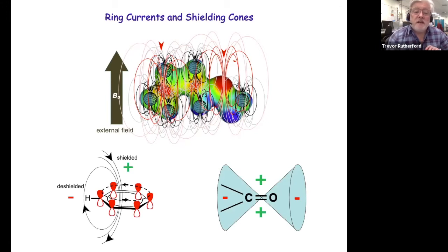I should say there is a caveat about these fields. The local fields of circulating electrons produce this shielding effect, but we also have a delocalized spread of electrons around pi bonded systems. And these also produce very profound local magnetic fields within the molecule that give the characteristic positions for each of the frequencies in the NMR spectrum.